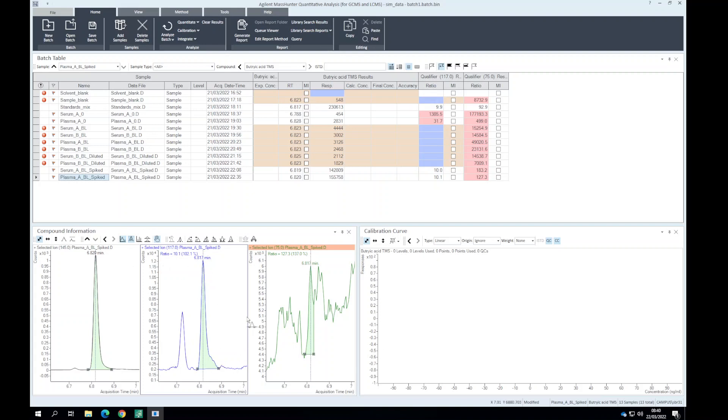That's just to give you an idea how to deal with importing data into first looking at it briefly in qual and then into quant, and how we build it into a method.